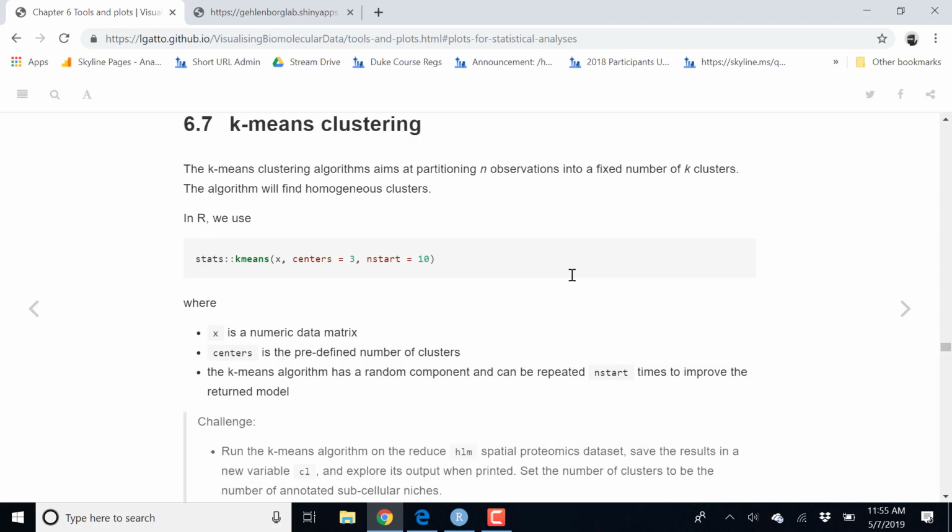We wait until each of these, which is very fast, converges, and then we calculate the sum of within-cluster distances. So we take all distances between points and the center of their cluster, square these distances and sum them, and then sum these values for all the clusters. Among the 10 iterations, or the 10 parallel k-means clusterings, the one that gives us the smallest objective function, the smallest total sum of squares, will be considered the best clustering. But again, there is no guarantee that this gives us the absolute best clustering.